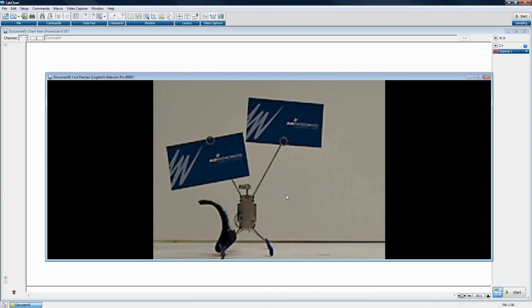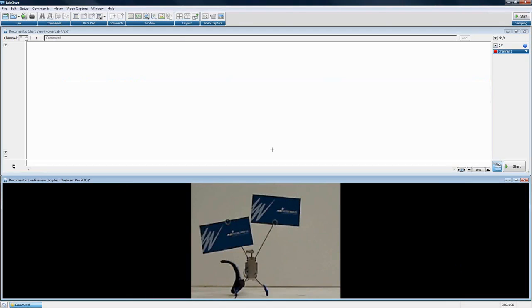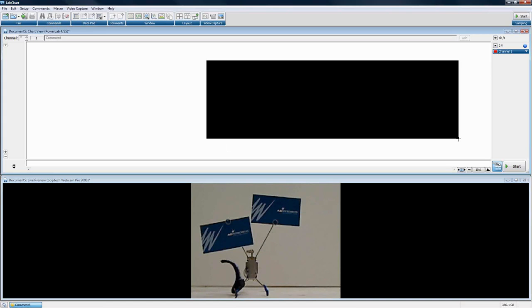So my setup here, I'm going to go ahead and do a smart tile here as well. In channel 1, I actually have a pulse transducer connected here, and that's the output that's going into channel 1. I can have my little wind-up child's toy here to give us something that we can see on our video, as well as give us some vibrations on that pulse transducer, so it will actually be recorded here in this file, in channel 1.